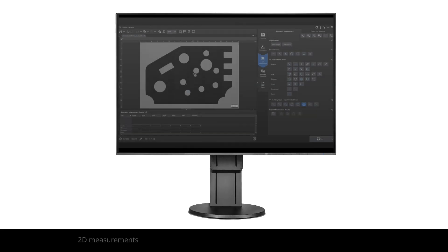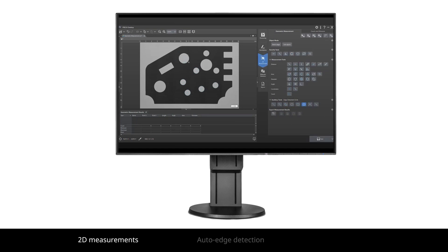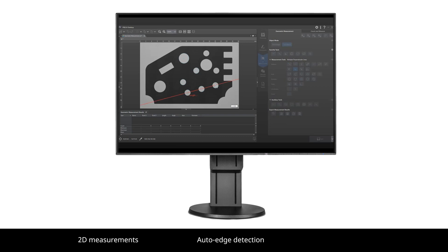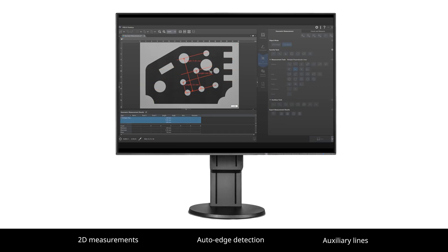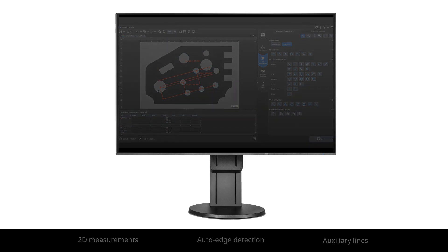The software's dedicated 2D measurement functions, such as auto-edge detection to reliably measure the distance between two points and auxiliary lines to make complex geometric measurements, give you the tools to meet your production and inspection challenges.